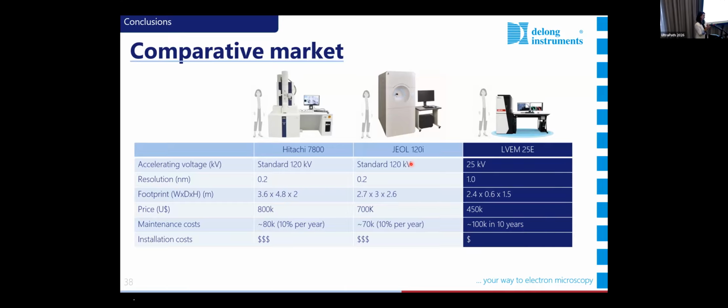And then we have a YAG crystal. I know, now I sound like an engineer here. So everything that is detected is actually photons, not electrons. It's a CMOS camera, so it's a very, very different system. Also, the advantage is the price is less expensive because you are detecting photons, light, instead of electrons, because of this inverse system that we have. If you are interested in the technical part, the papers are the best way to really understand, or you can talk to me and I can show you how the design is completely different from the conventional TEM.